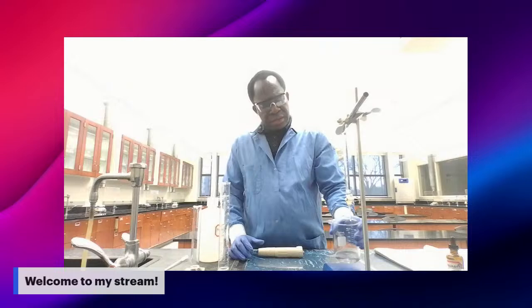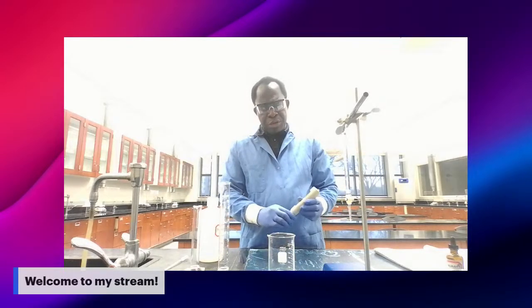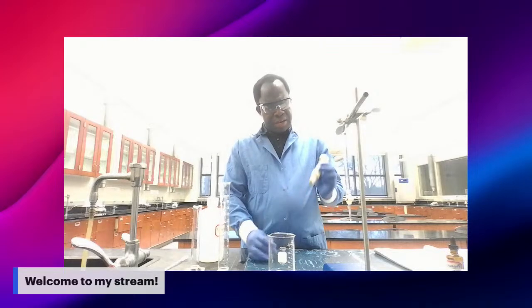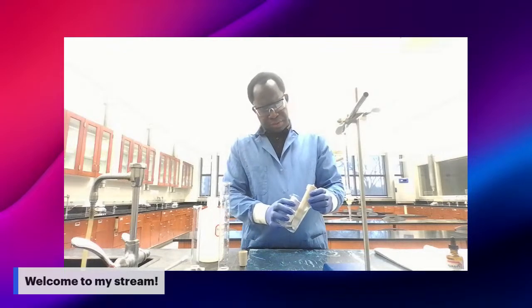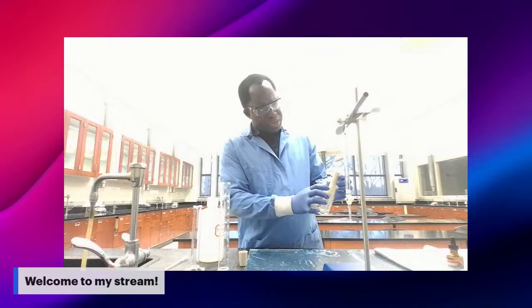Now after you shake, you're going to measure the pH of the solution. Make sure you turn your pH meter on, and then you measure the pH. So the pH of my solution is 3.4.